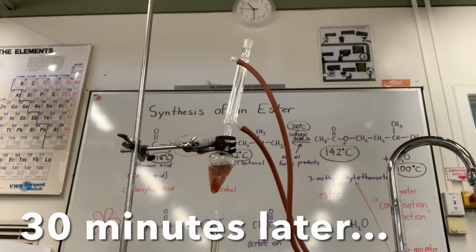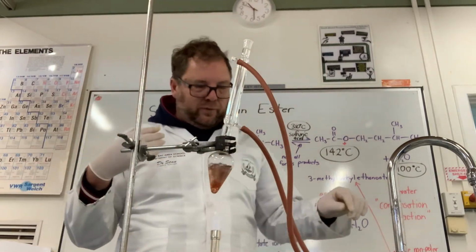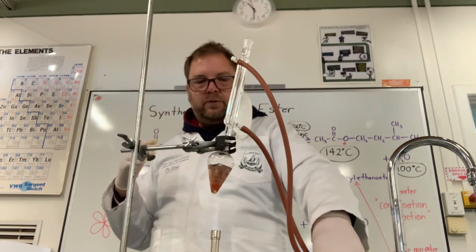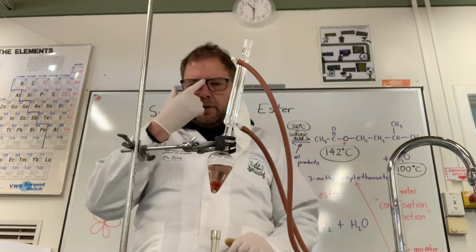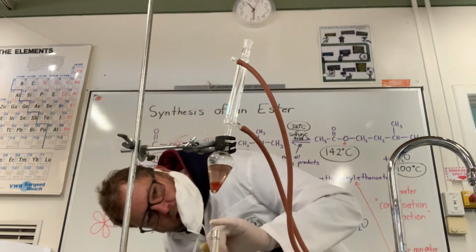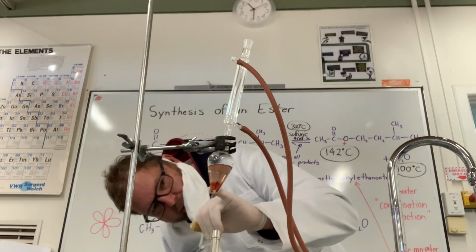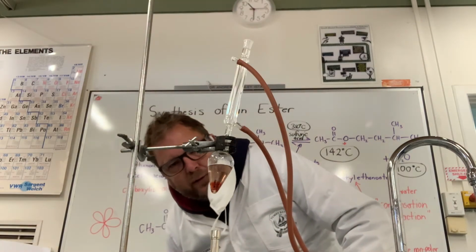Yeah, just so I knew where that gap was. Okay, so that's been going for half an hour. So what I'm gonna do firstly is just turn the heat off. Before I can do too much more, I will need to let that cool down a little bit. But hopefully you can see now we have two different layers here. We can see this sort of browny orangey layer at the bottom, and that's distinct from the layer at the top.